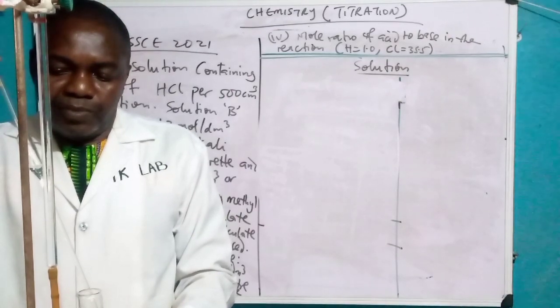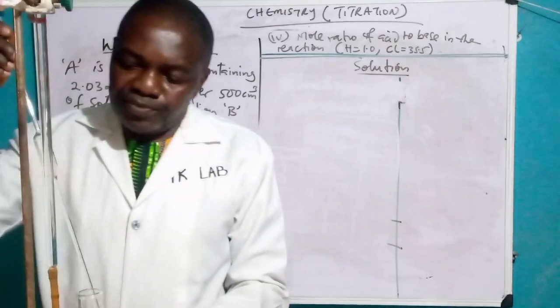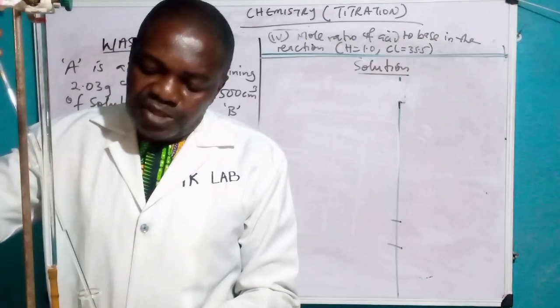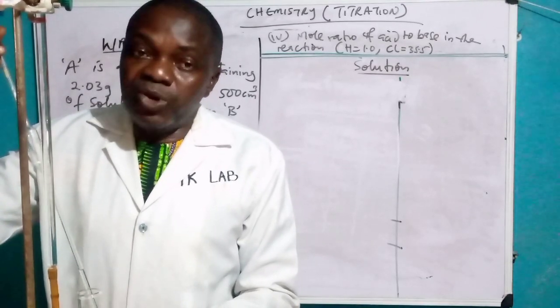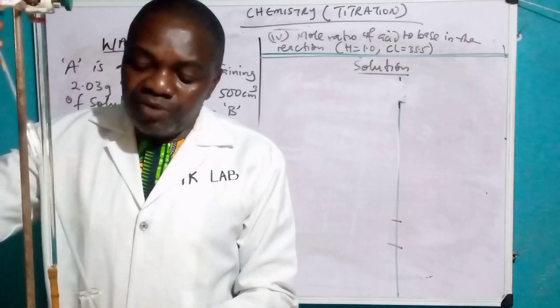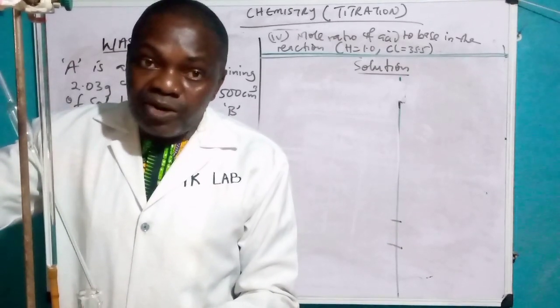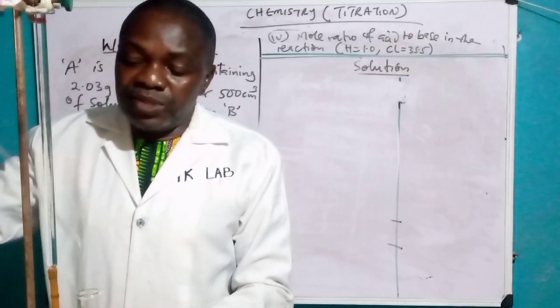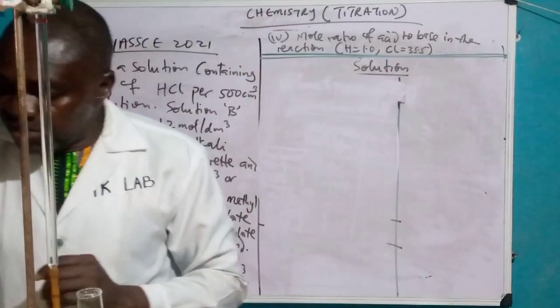It's flowing, not too fast, but you allow it to drain through on its own. You must not blow it. If you blow it, some saliva may add to it and give you a wrong value. Moreover, the last drop, which is supposed to remain according to the manufacturer's calibration, can never go. There's always a last drop. It has been calibrated in such a way that that last drop must always be there.